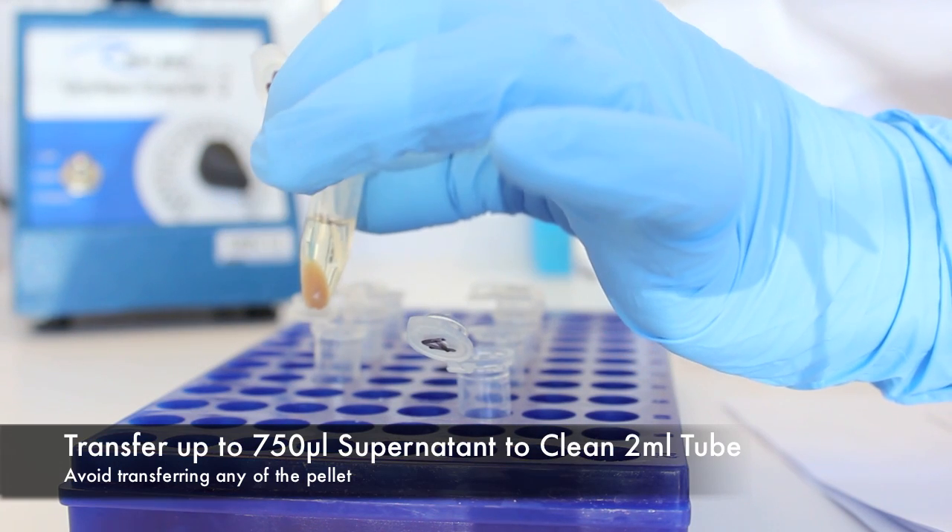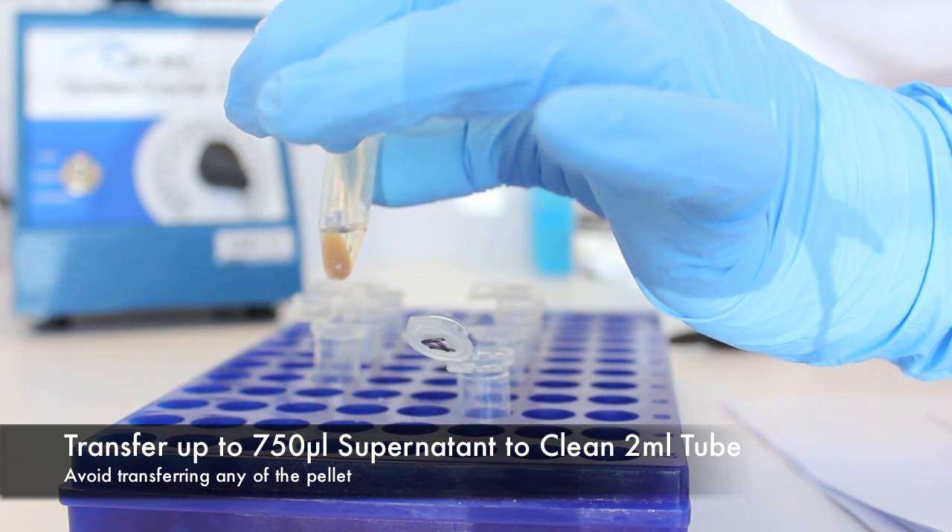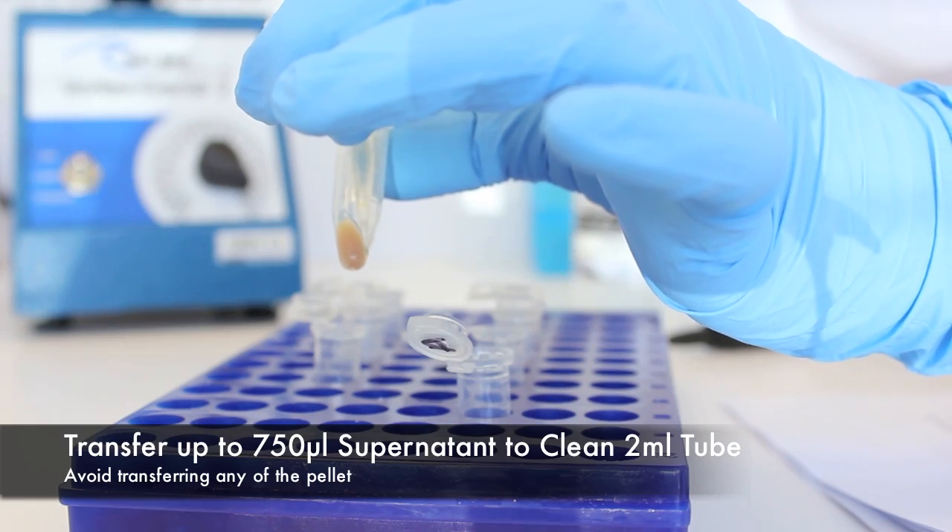Avoid the pellet. Transfer up to, but no more than 750 microliters of supernatant into a clean 2 milliliter collection tube.